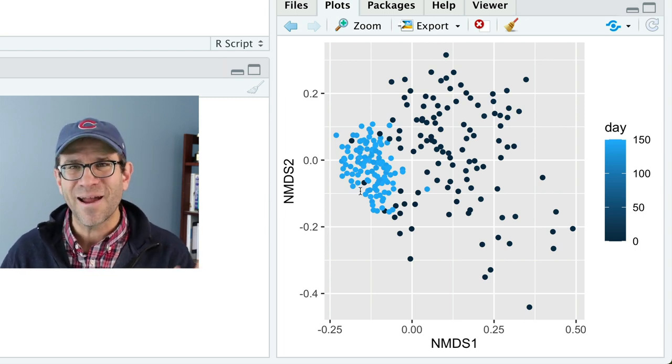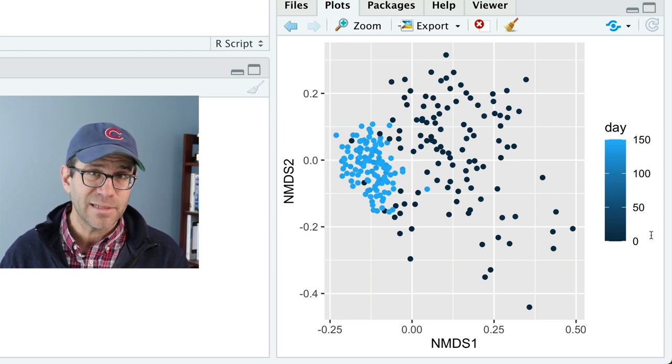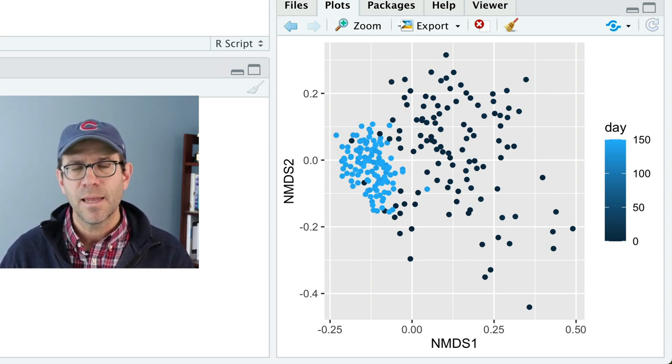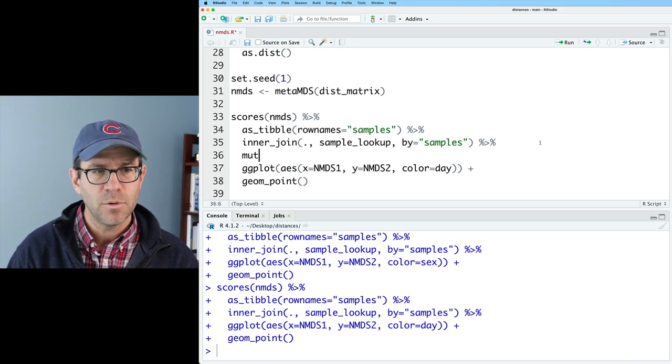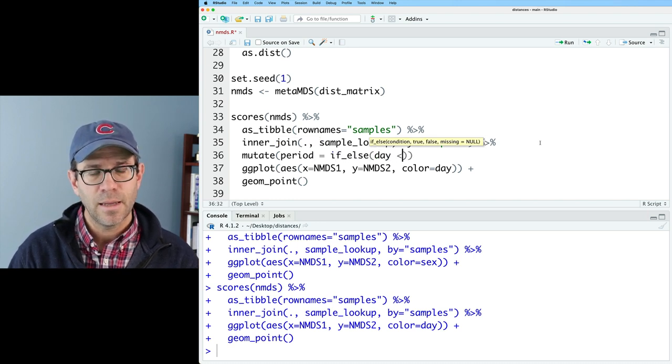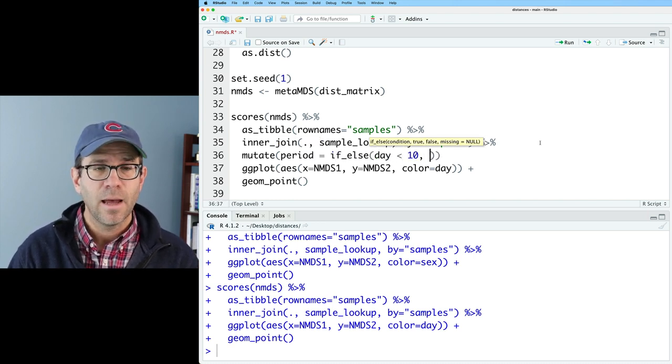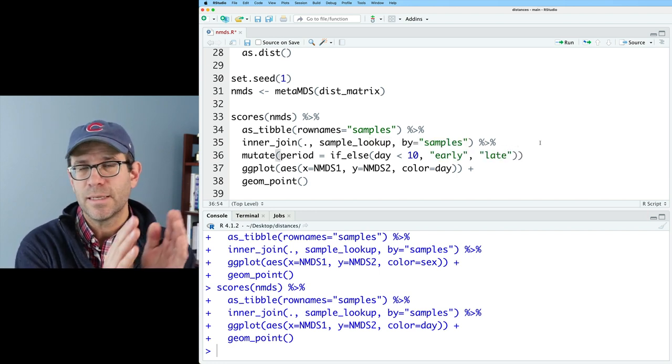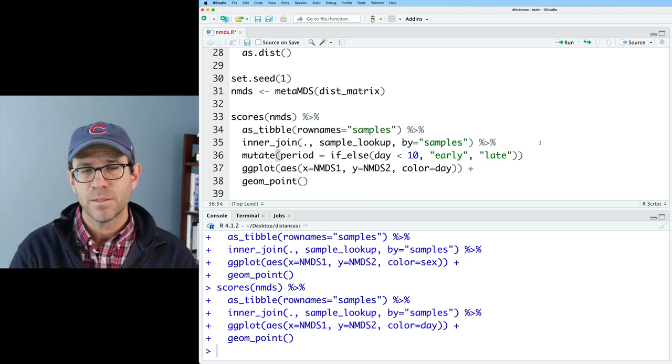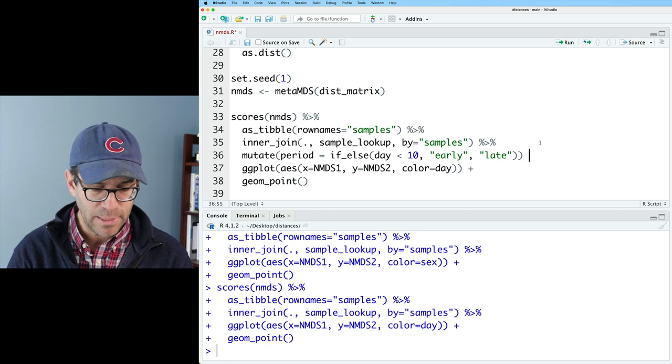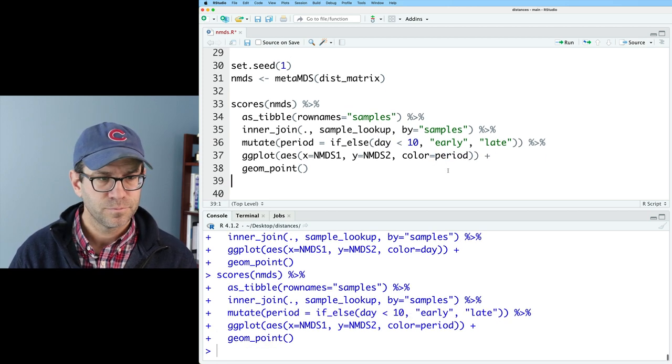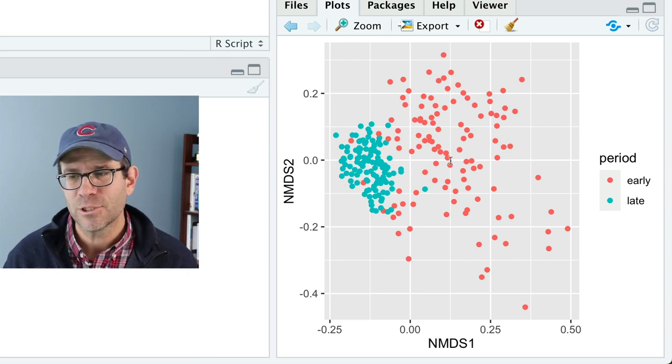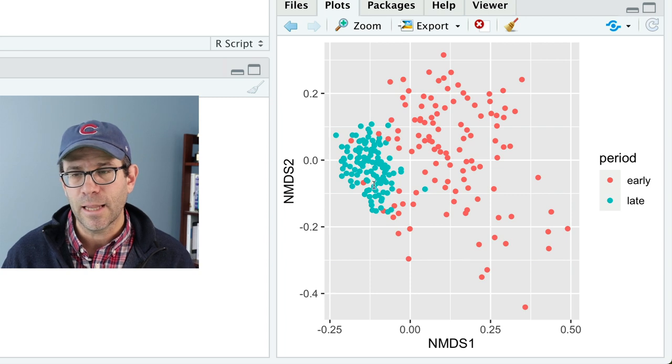All right, enough biology. So here we're using day as a continuous variable. You'll see that we have a gradient of colors here. I'd rather day be a dichotomous variable or categorical variable. So let's go ahead and do a mutate. We'll define a column called period, and I'll do if else day less than 10, I will call that early. Otherwise, I'll call it late. So we had day zero through nine, and then 141 to 150. So those zero through nine will be early. The 141 to 150 will be late, and then I will color it by period. And so now, sure enough, we get the same type of ordination, but with the default colors for early and late.